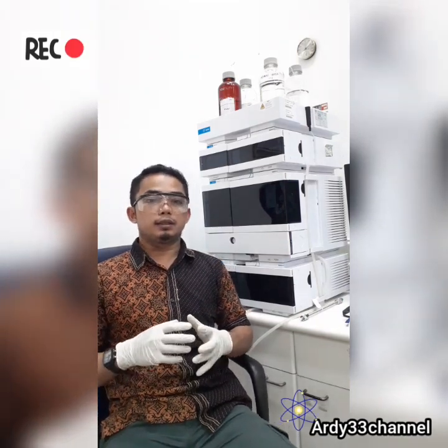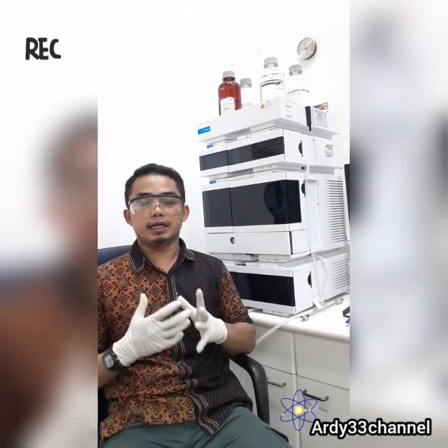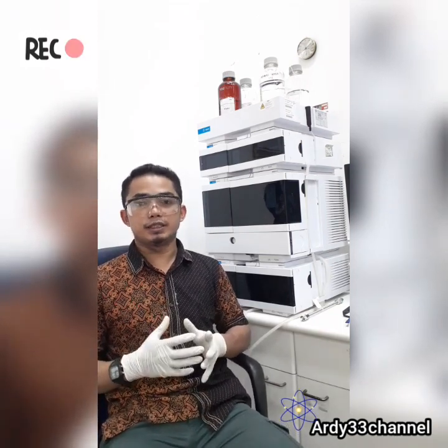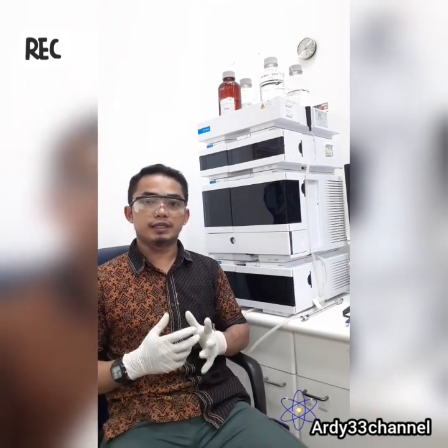But beside advantage, HPLC has limitations. Number 1 is the cost, high cost. HPLC can be costly, requiring large quantities of expensive organics. Number 2, complexity.